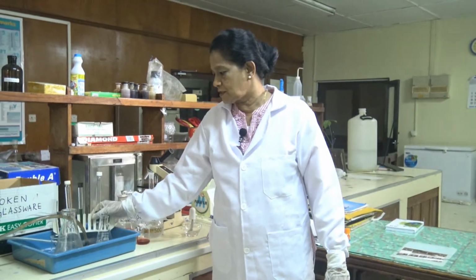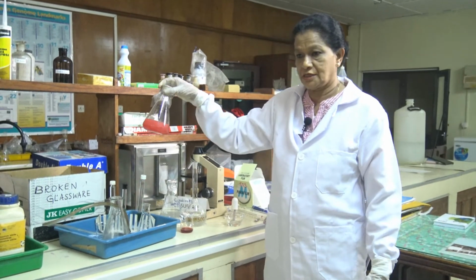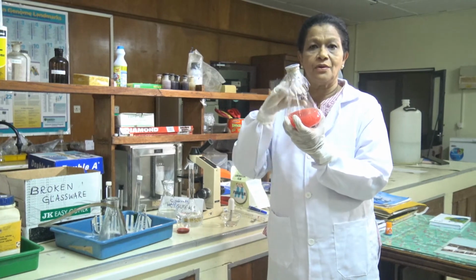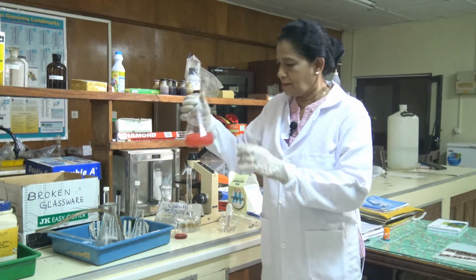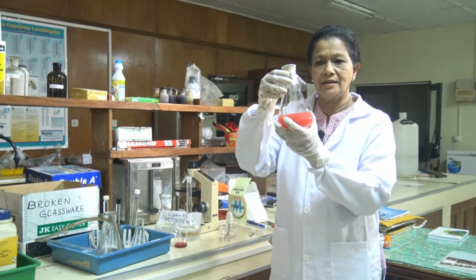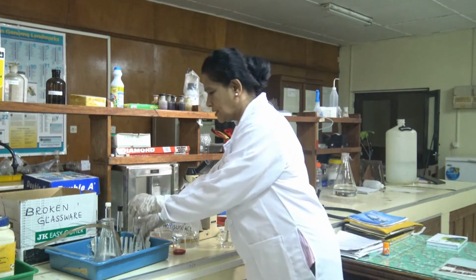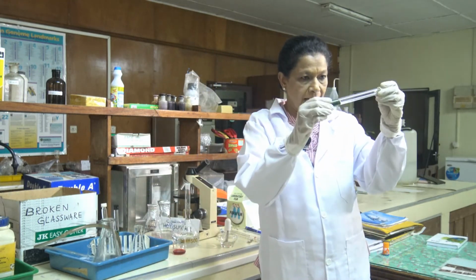It is a must to label all the test tubes or flasks containing contents like this, with the name of the medium and the date you prepared it. Do not leave test tubes like this without labeling.